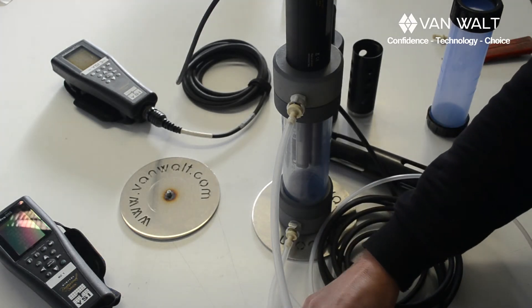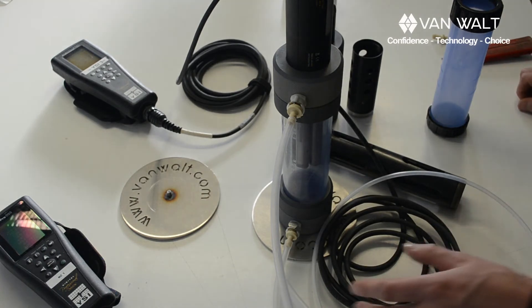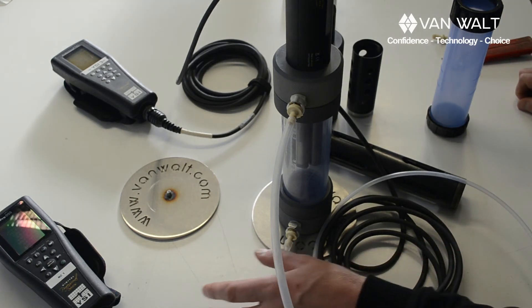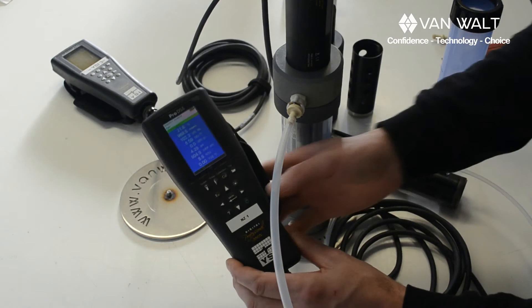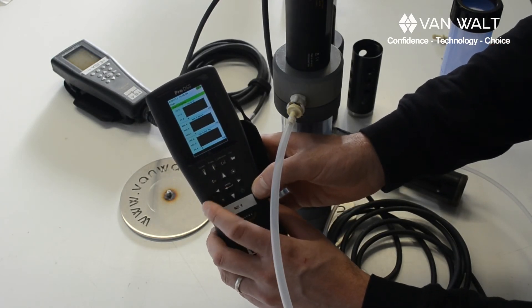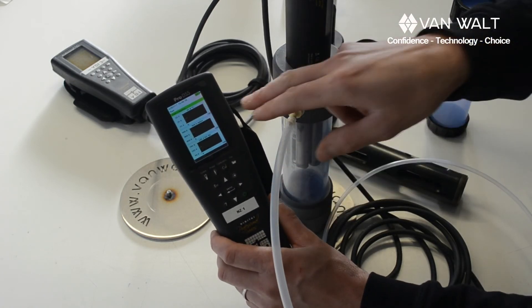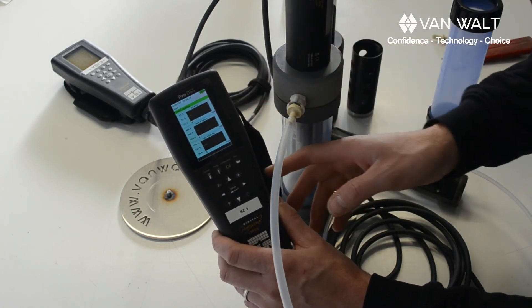One other thing that is quite useful: if you're looking for stability on your water quality meter, on the Pro Plus here if you press the left or the right button it will actually give you a real time graph and you can watch your parameters stabilise on that. That's kind of useful.